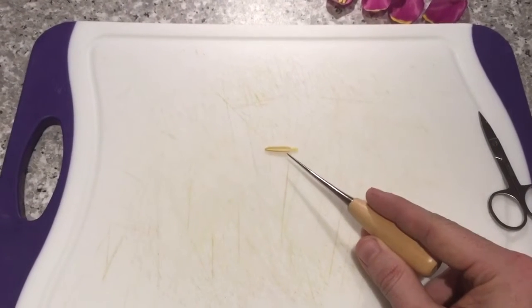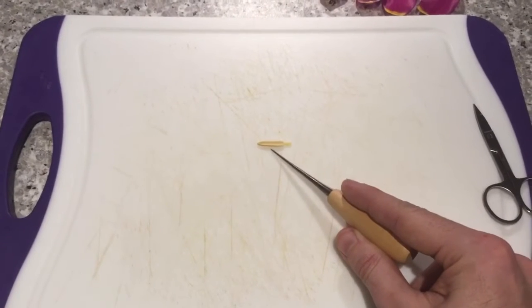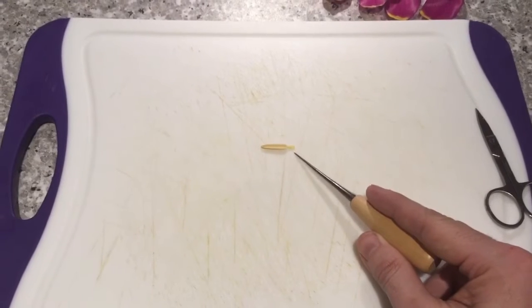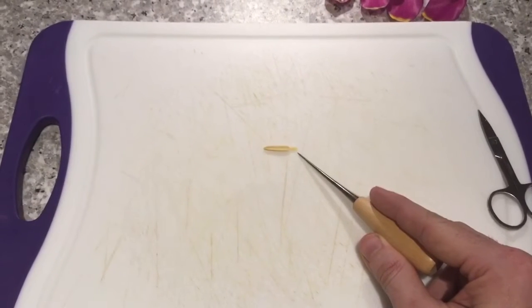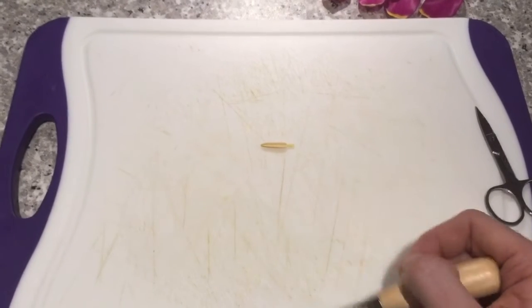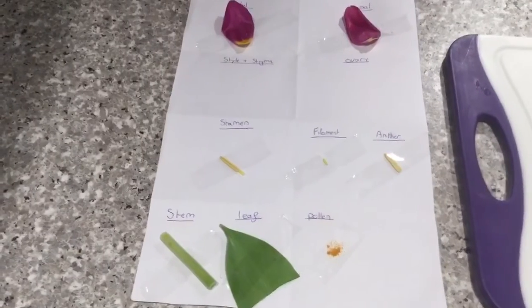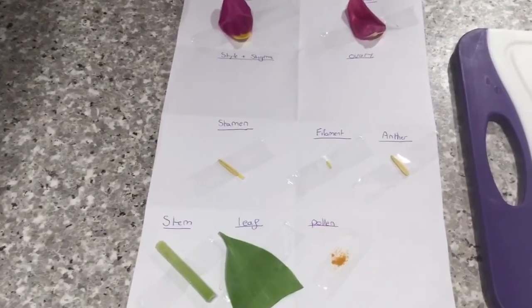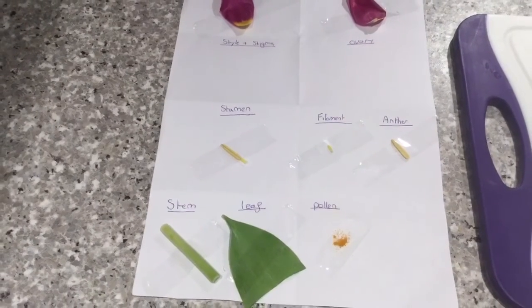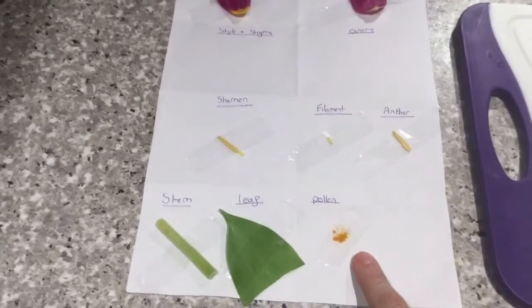The next thing we're going to do is have a look at the stamen. It's made up of two parts: the anther up here which produces the pollen, and the filament down here which connects it to the rest of the flower. We can separate that using our tweezers and attach both to our sheet. I've removed all six of the stamen and also took this opportunity to split out the filament and the anther which make up the stamen. All of this has been added onto my sheet along with some pollen.